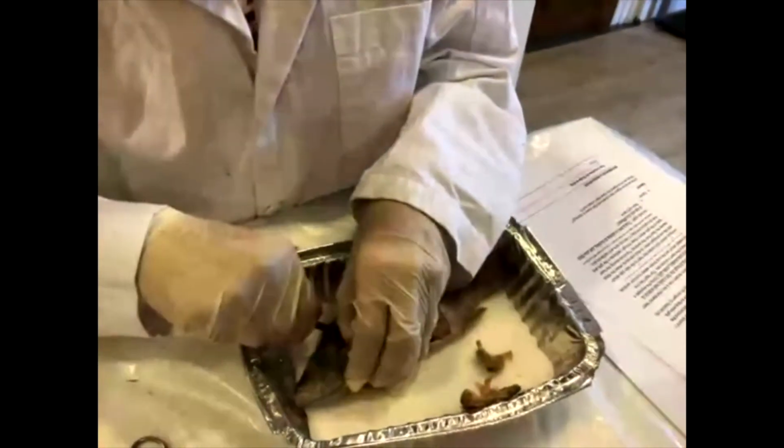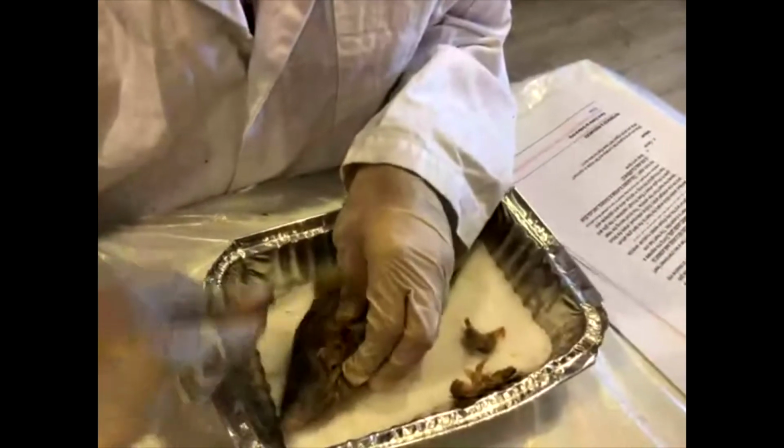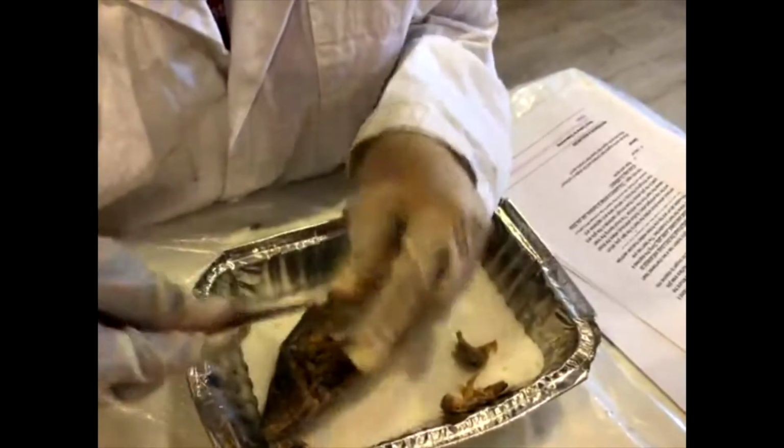All right, folks, this might not work out for us here with the heart. They're so well protected in here, it's actually quite hard to remove it intact. Oh, that's cool.